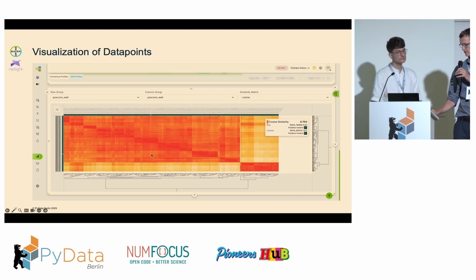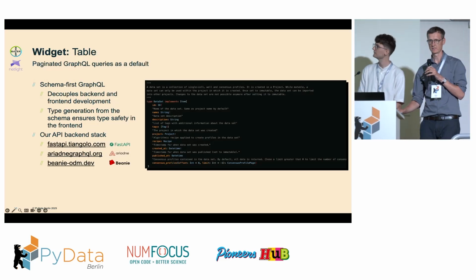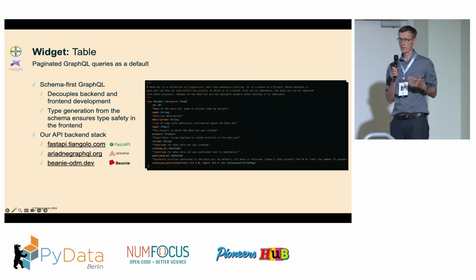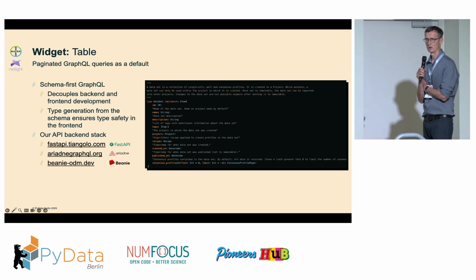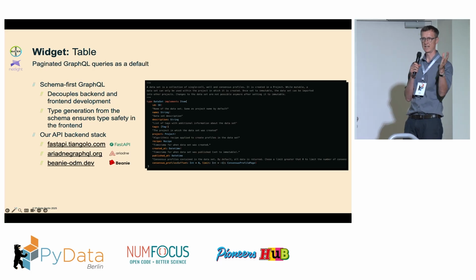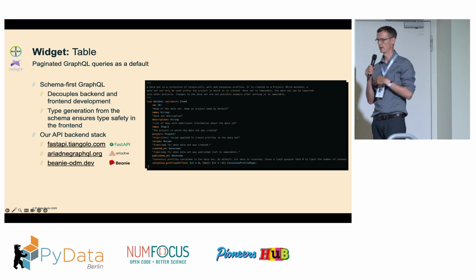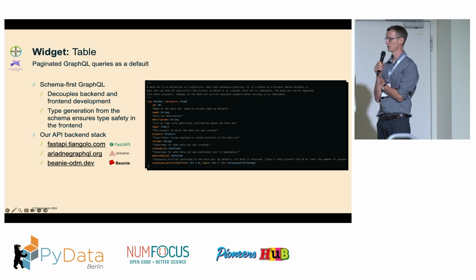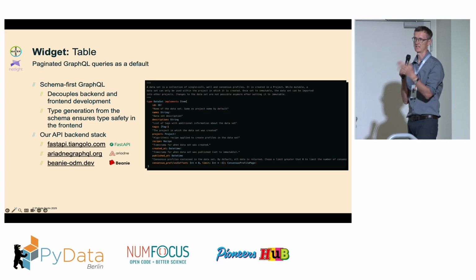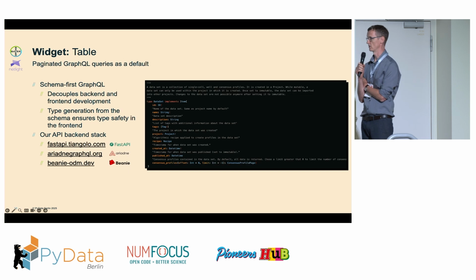And now let's have a deeper look into how we actually built this, which is probably more interesting for most of you. So we thought, let's first think about this table. You saw there is a lot of information about these profiles, right? We have the combination of basically this spatial information we create from the representation of compounds as consensus profiles, as we learned, and some metadata. So basically what's actually the compound, right? What's in there, in what concentration, and so on and so forth.